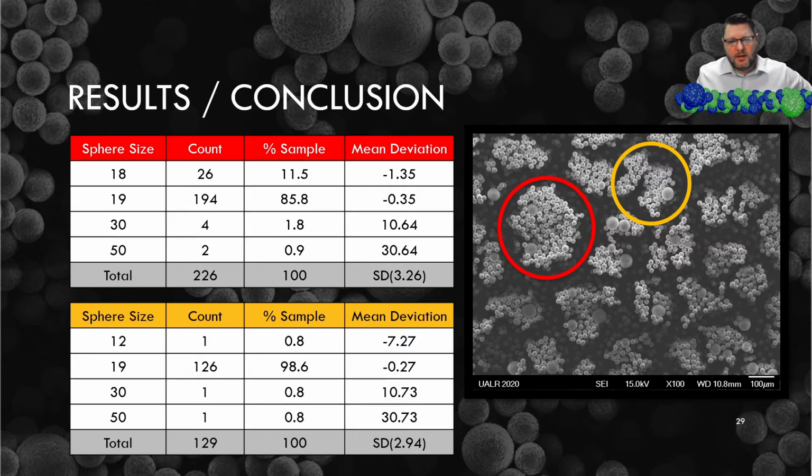So now the package insert says that their spheres are 20 to 60 microns in size. 1 micron is an extremely small difference, and I would assume, without having imaged the spheres with a biological type prep, that they would be just a little bigger, because we didn't allow the fluid of the surface to shrink up just a bit whenever they're dehydrating.